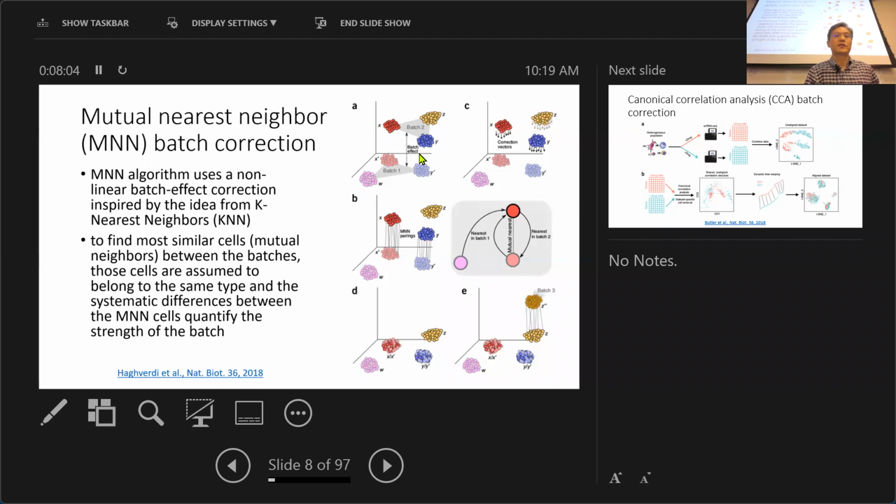This algorithm will look at nearest neighbors based on their embedding. You can use 3D or even 4D, 5D, depending on how many features you want to keep. Anyway, you can compute the distance from one cell to all the others, and have a pairwise distance.